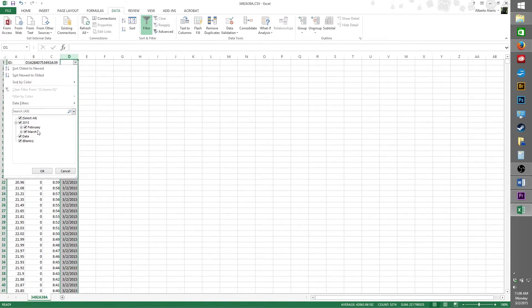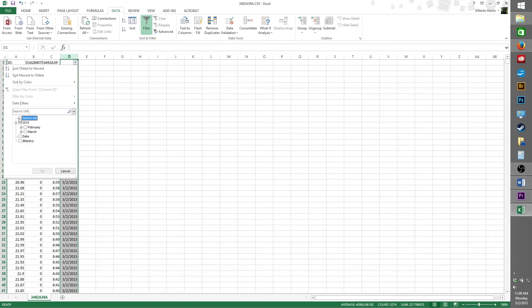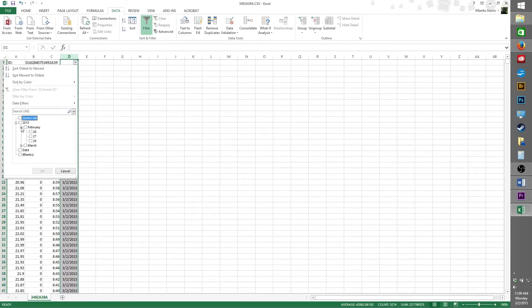We're going to deselect all of them and then manually select the date we're looking for so that only one remains. Since the data we're looking for is what's stored on February 27, 2015, we're going to expand the 2015 box to show the months. And then we're going to expand the February box to show the days. We'll click on 27th, and then click OK.